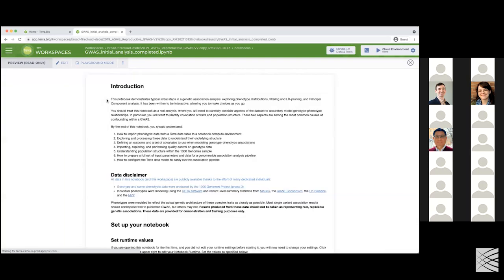In fact, you don't even need to have cloned the workspace to do this. If you just had read access to a workspace like we did for the original one, you could look at this without needing to create a cloud environment. But I want to actually show you how we would edit and run it. And to do that, we need to start a cloud environment.